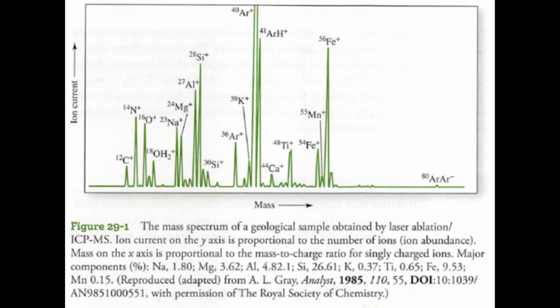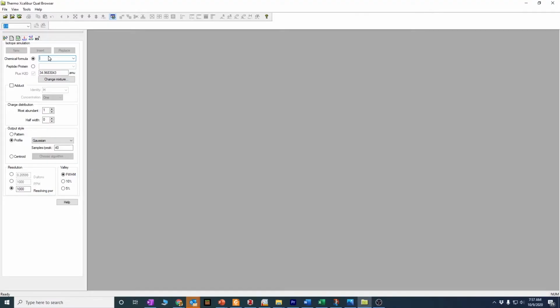Now, the truth is you see a carbon peak there, but ICP is not really good. We're not going to use ICP very often to look at carbon, nitrogen, oxygen for really small things. ICP really does best for things that are sodium atoms or larger. Mass spectrometry sees isotopes. So this is where the periodic table is going to betray us a little bit, because you can get an idea of what peaks you expect to see looking at the periodic table, usually when you're talking about organic compounds.